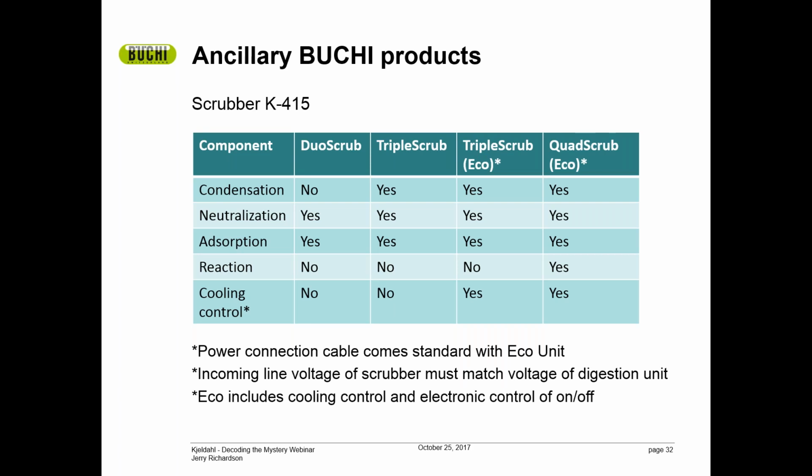Okay, the difference between the eco unit and the non-eco unit is the eco unit basically has a valve where, if you're plumbing a tap water to it, it has a shut-off valve. So when you have the unit itself plugged in and you have the tap water on, when it's not in operation, that valve is in a closed state. So you're not wasting and having water just run down and out.